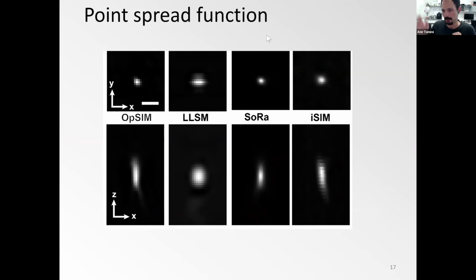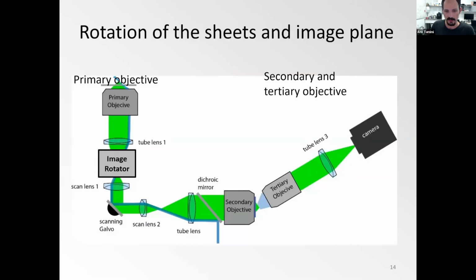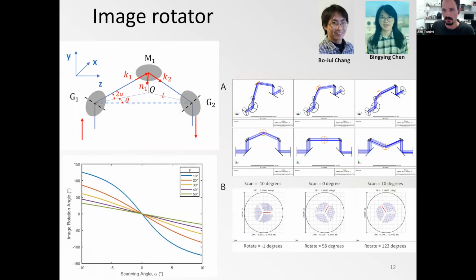Yeah, hi, I'm Amr from Robert's Lab. I just had a very quick question. You may have mentioned this and I missed it. The 10-degree angle that you mentioned, the galvos have to do 10 degrees. Is that just to fit the field of view on the stationary mirrors? No, to enable the rotation angle.